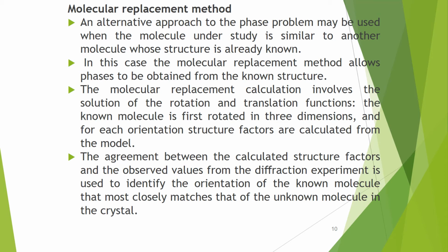In this case, the molecular replacement method allows phases to be obtained from the known structure. The molecular replacement calculation involves the solution of the rotation and translation functions.